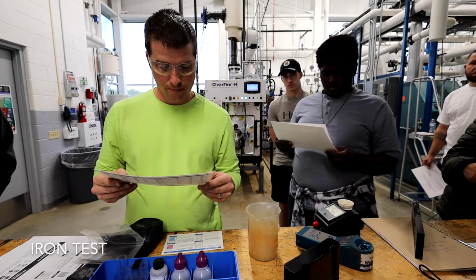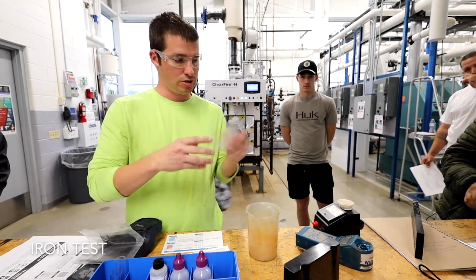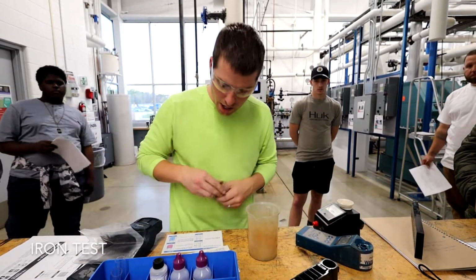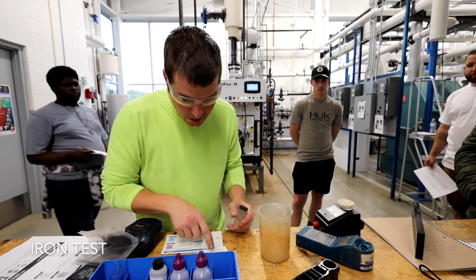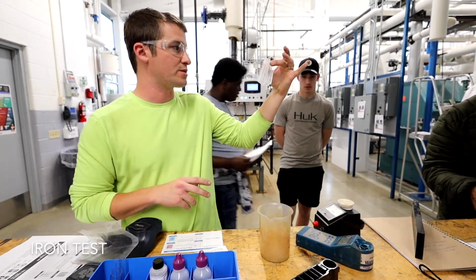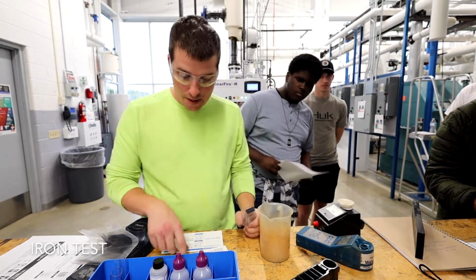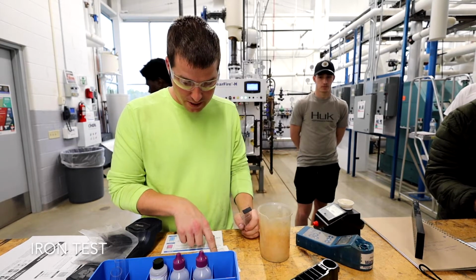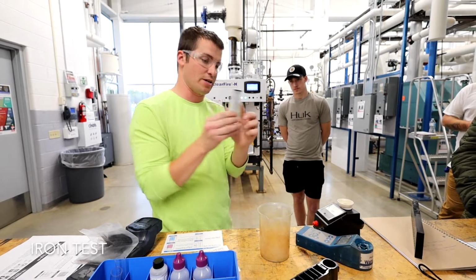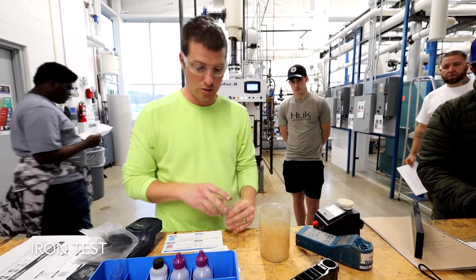Here's what we're using. Take off this cover. Go to step 2. Basically it's telling you to determine what you're running. We're going to be running the 11.5 milliliter test, which are these vials. Always place the test cells with the frosted side facing you. You can see this side is frosted, this side isn't. You want to make sure the frosted side faces you because that determines how the reading looks.